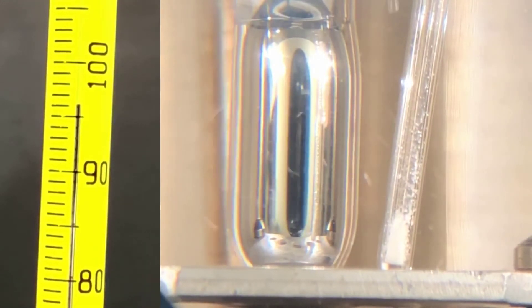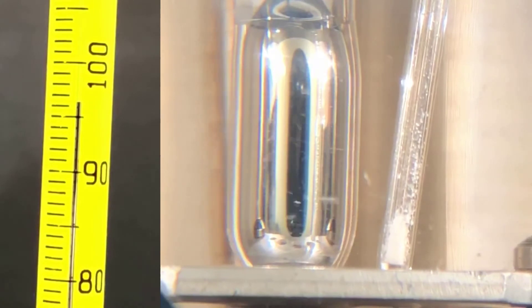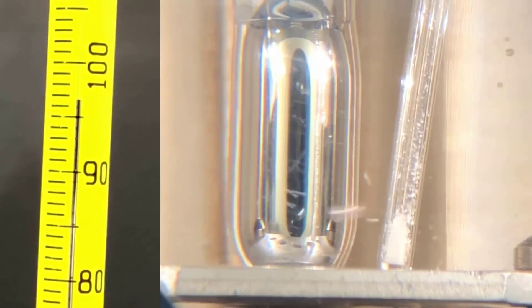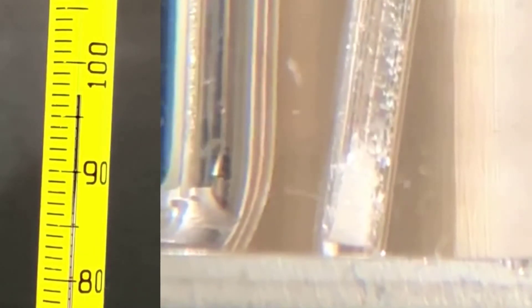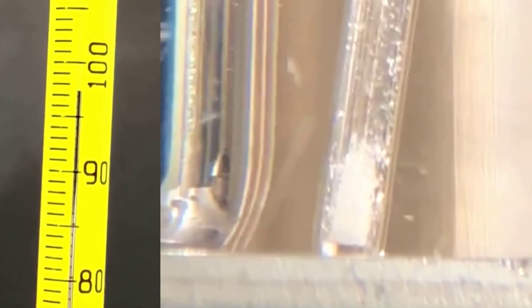When you actually determine a melting point in the lab, you'll go much more slowly than this, increasing temperature at a rate of about 1 to 2 degrees Celsius per minute. Remember that melting point is a range of temperatures. When you see the first drop of liquid, record the temperature.